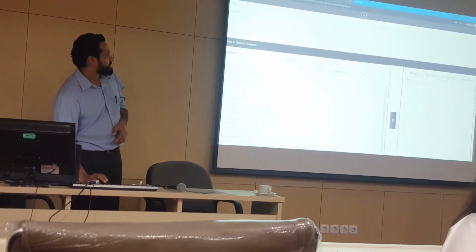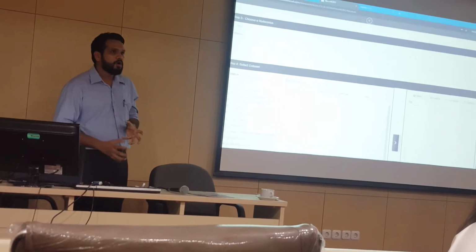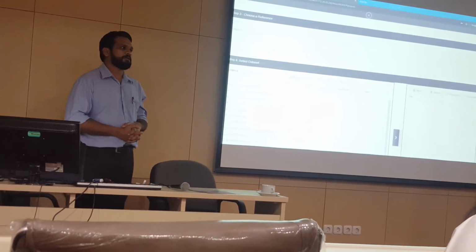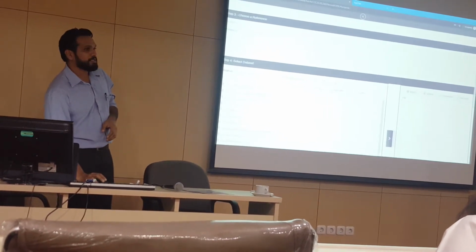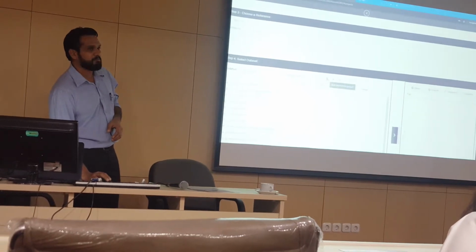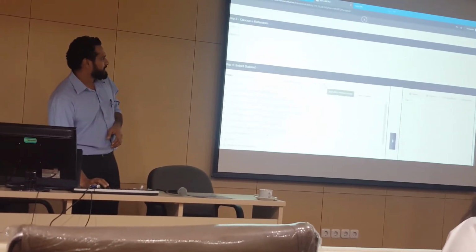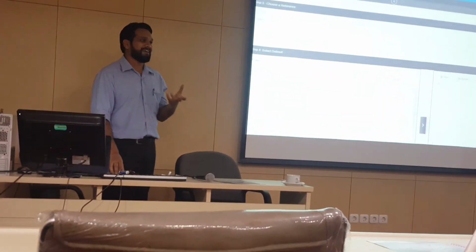The next step is actually adding your data. So this is your data within your data hub, or you can actually use data from completed projects. If you want to use data from completed projects, you just have to go to add input from project, and you will be given a list of all your projects that are completed and that you have access to.